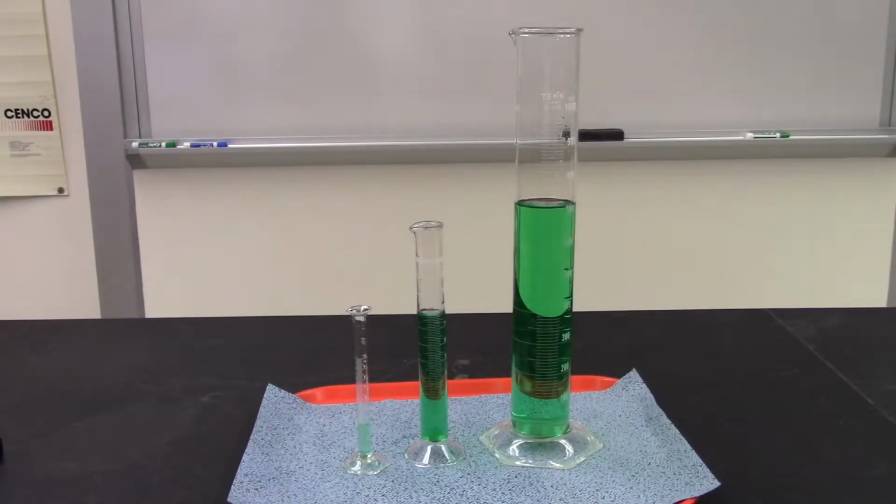All right, class, now we're on to part two, volume of liquids. First, we're going to do the graduated cylinder table in your data sheet, and then we'll move on to the test tube data later on in this video. So right now, we're working on part two, volume of liquids, graduated cylinder data. Now, here we have our three graduated cylinders. Let's fill out the table, shall we?